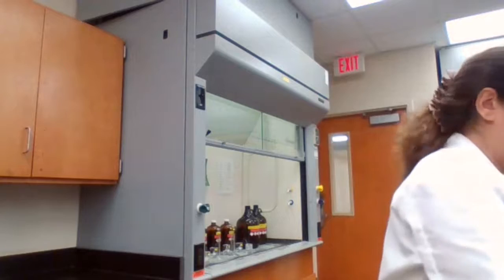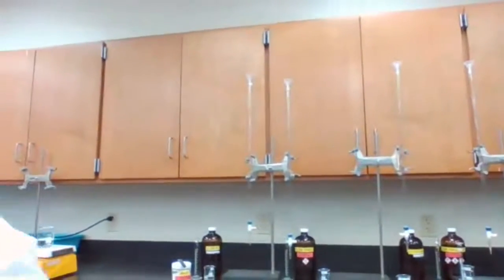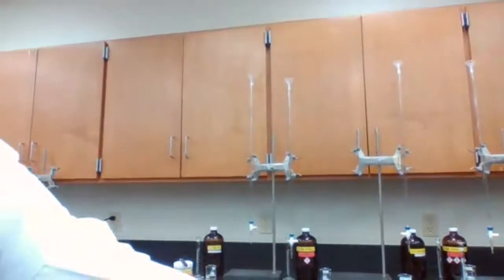You always know that in acidic and basic solution, the indicator is going to have a different color. But what's more important is to know the equilibrium reaction for the color, and how that equilibrium translates to the color change based on a high concentration of H+ or removing H+ from the equilibrium.